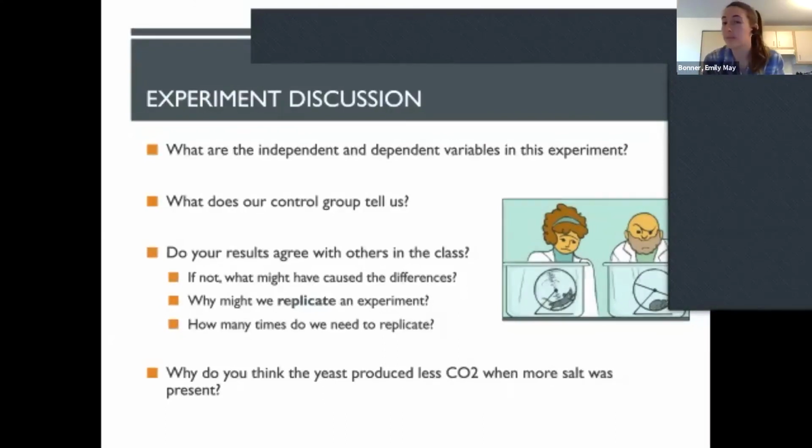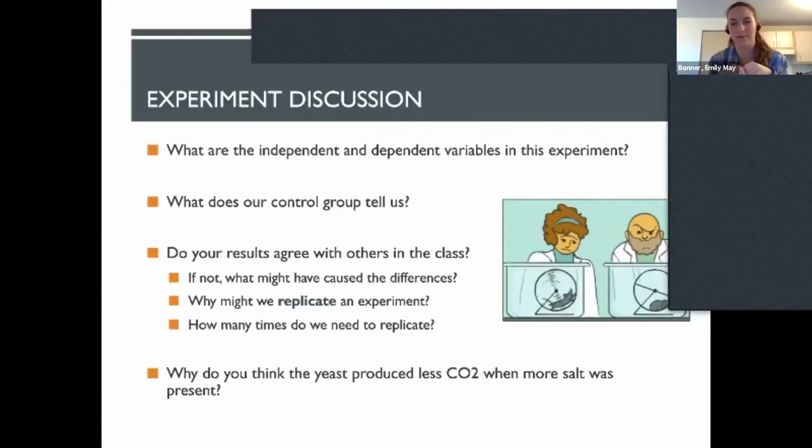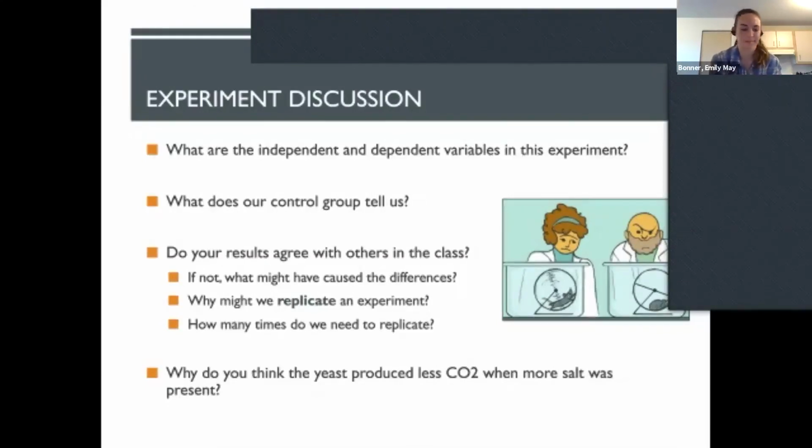And for a lot of people, I would guess that this baggie had the most air in it, the most carbon dioxide. So what was the point of the control baggie, and what do you think that tells us? Just think about it for a second. So the control baggie gives us an idea of what we expect to see without adding any salt. So these should be healthy yeast that don't have any salt added to them.